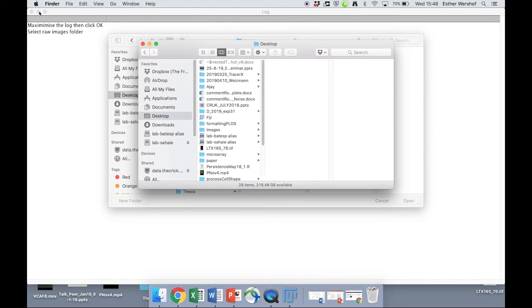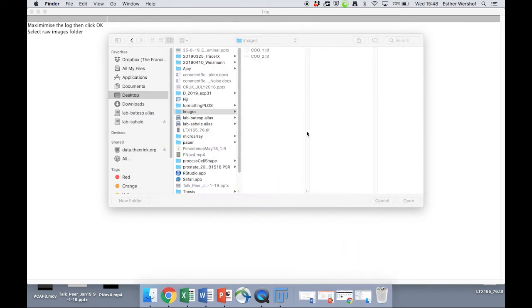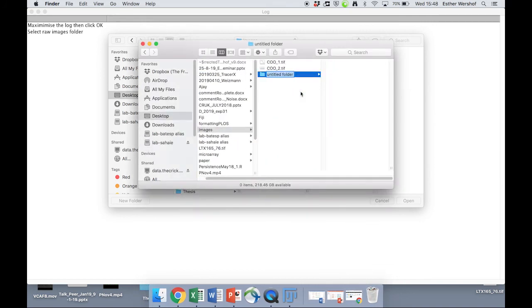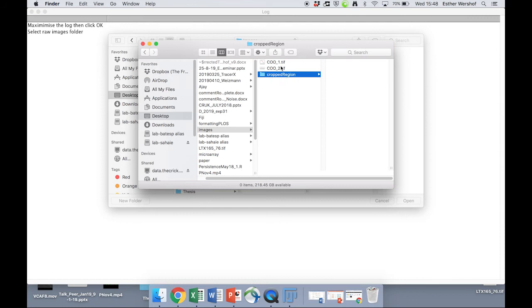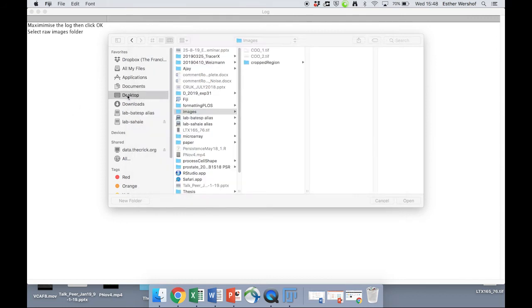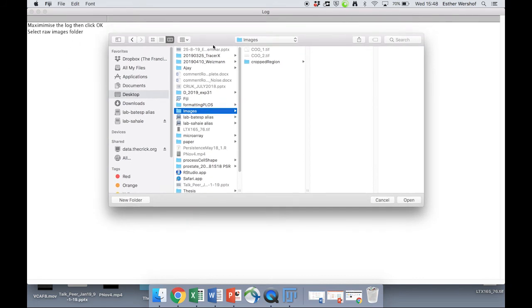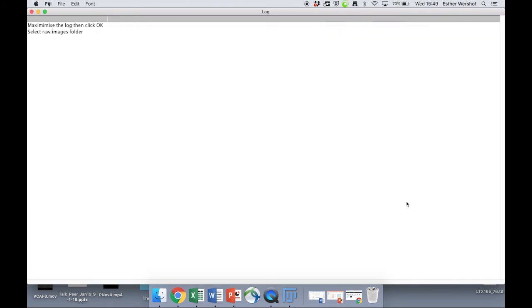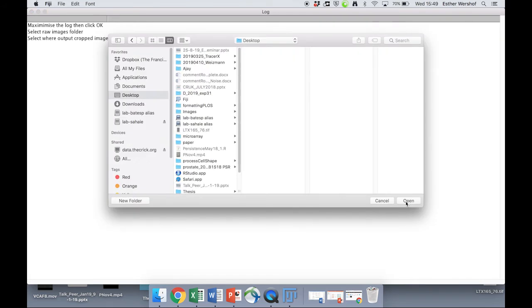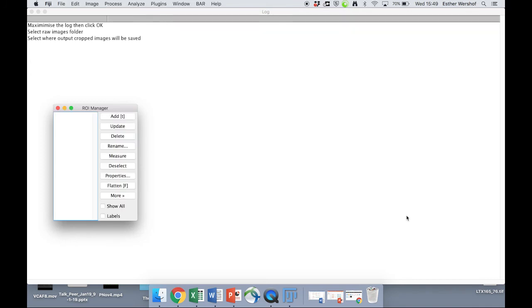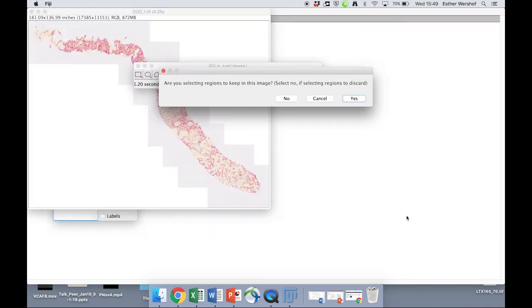If we go to the images folder, we're going to select some cropped regions, we're going to make a new folder where those cropped regions can be saved. So in the plugin, we're asked to select raw images folder. So that's here. And we're asked to select a place where the output cropped images will be saved. So we're going to save them here.